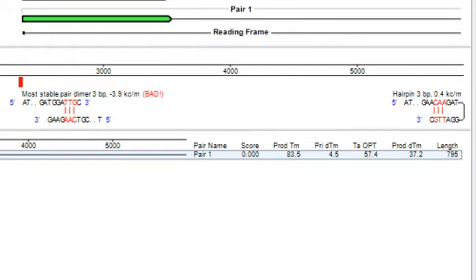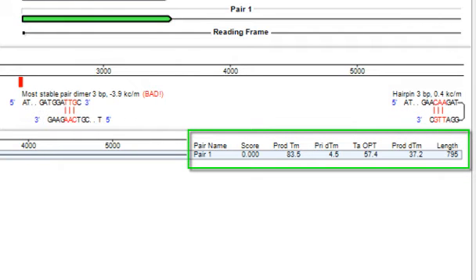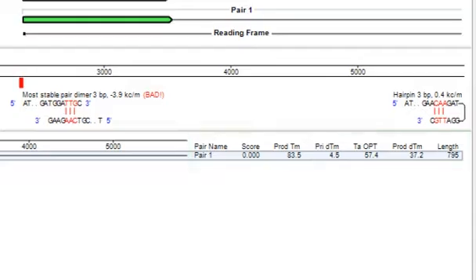For each pair, the product length, melting temperature information, and a quality score are displayed.